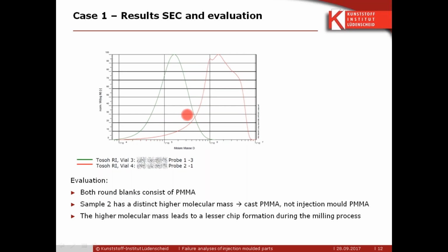Okay, so you can always do more analytics, I guess, Martin. However, I just take this as a general recommendation. Of course, if you get a failure, it might be too late. But there are ways to learn how to operate a DSC. So at some point, it might be interesting if you do incoming goods inspection, or as Martin recommended, maybe once or twice. It's very helpful to do TMA measurements.